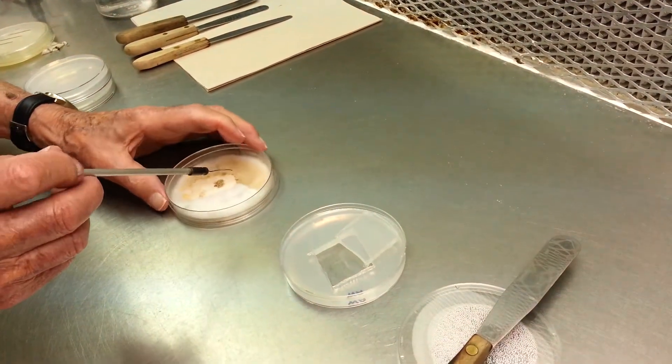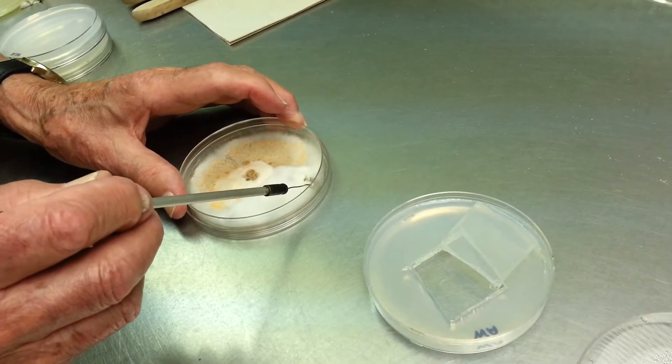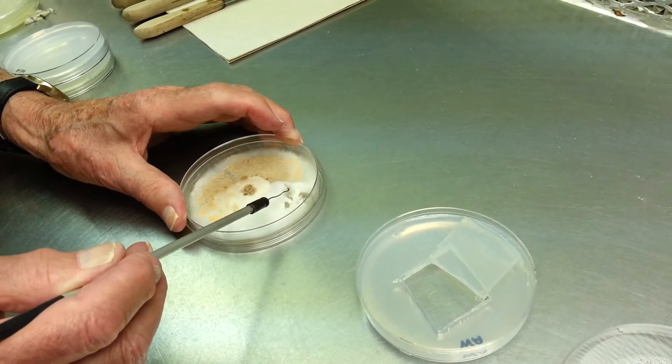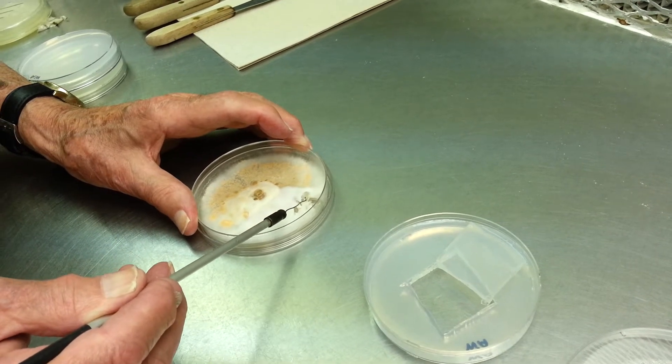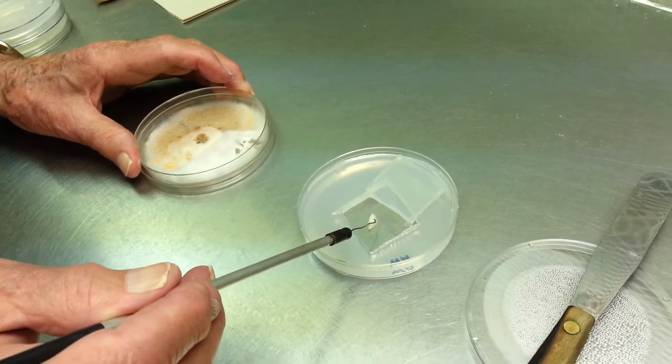Take a piece of the contaminated culture, a very small piece. Put it at the bottom of the plate. It doesn't matter the size? No, just a small size.